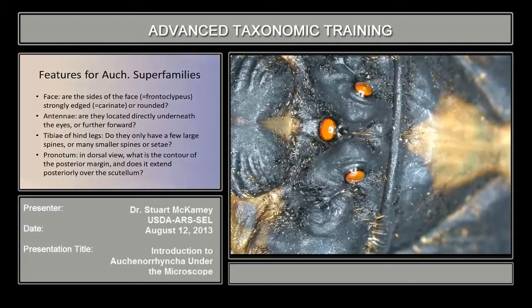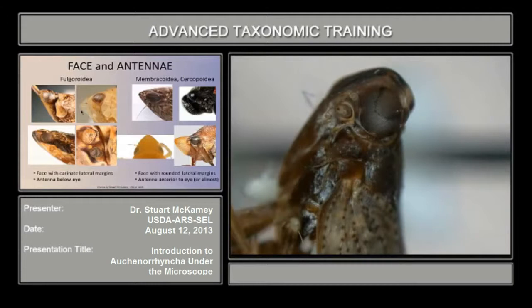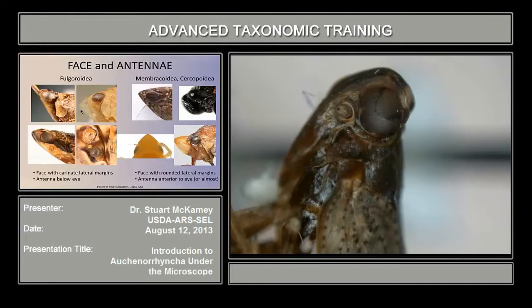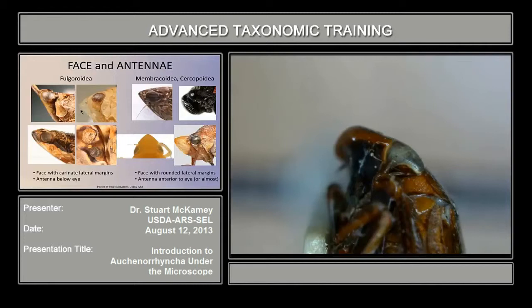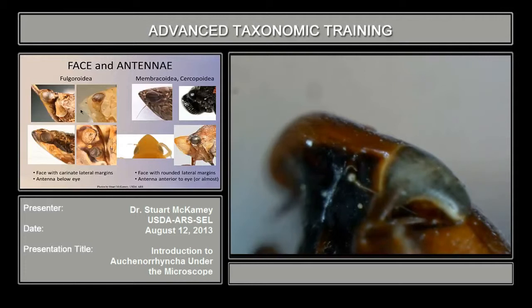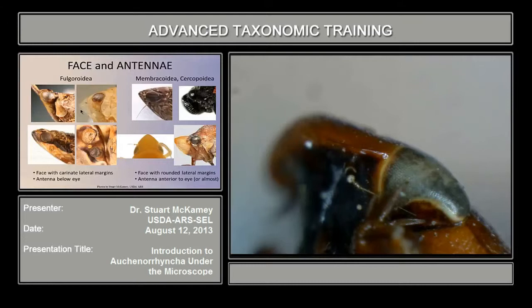Going to the second slide, we look at some examples. The Fulgoroidea have a carinate edge of the face or frontoclypeus — a sharp edge or keel — and the antennae are directly beneath the eyes. This contrasts with Membracoidea and Cercopoidea. In this leafhopper, you can see that the side of the face is rounded, and the antennae is further forward — sometimes it's underneath the edge of the eye, but never directly underneath the eye. This carina visible in this specimen is actually a longitudinal cleft over the antennae, not the vertical edge on the side of the face as in Fulgoroidea.